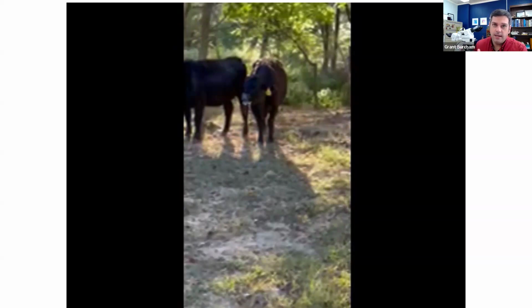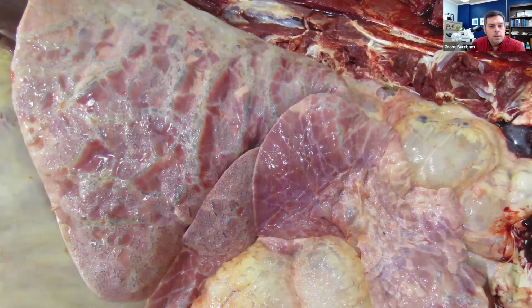So that's oftentimes where our diagnostic cases start, not always. Sometimes we get samples that are unconnected from the animal, from a biopsy that your veterinarian took, or blood that your veterinarian took, or a swab that your veterinarian took. But oftentimes, especially when I'm involved, my training and background is as a veterinary pathologist. So when I'm involved, oftentimes there is a whole animal that comes to the lab for autopsy. So given the clinical signs, pretty worried about respiratory disease in this particular case.